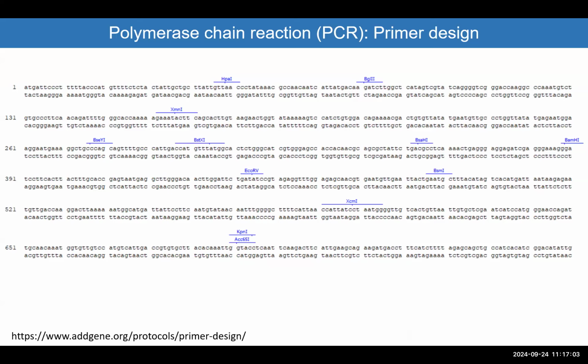So this is a piece of DNA that I want to amplify or clone, but unfortunately, there are no restriction sites that I can use in the beginning or at the end. And the assignment is most probably going to be like this. So how can I clone this? I can take this DNA and generate a forward primer and a reverse primer, taking into consideration the parameters I said, and you can go to the website and choose the primers from the program.